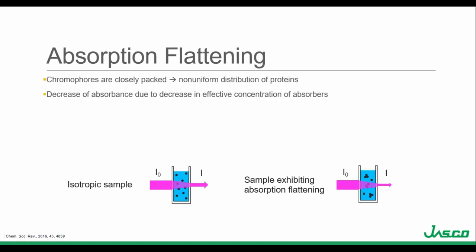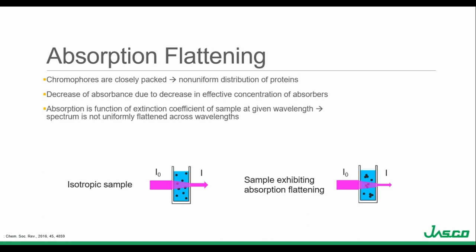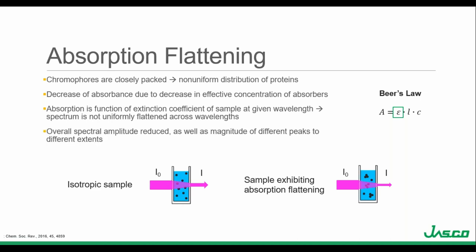Absorption flattening: in an isotropic sample, proteins and concentration are uniformly distributed throughout the solution, while in an aggregated or membrane sample, protein chromophores are tightly packed in localized areas while the rest of the solution has little to no protein. This non-uniform distribution leads to a breakdown of the Beer-Lambert Law — the effective concentration of chromophores decreases, flattening the absorbance and therefore the CD signal. Since a correction term can't be applied uniformly across the wavelength range, the overall spectral amplitude is reduced and the spectrum is distorted.